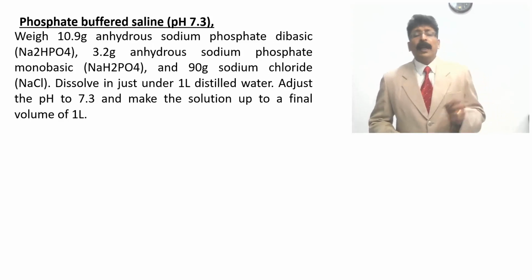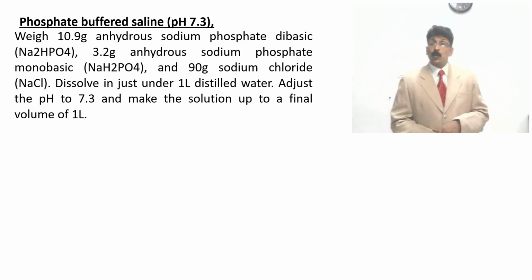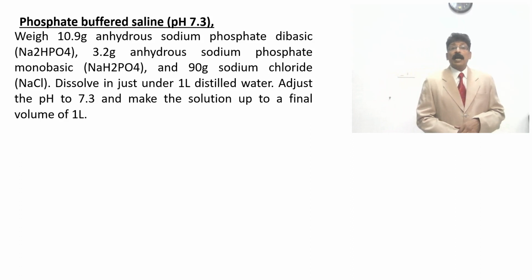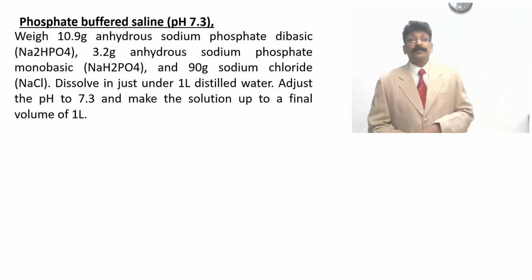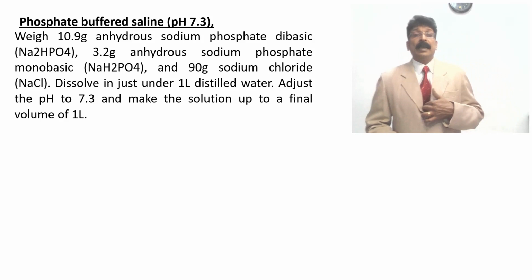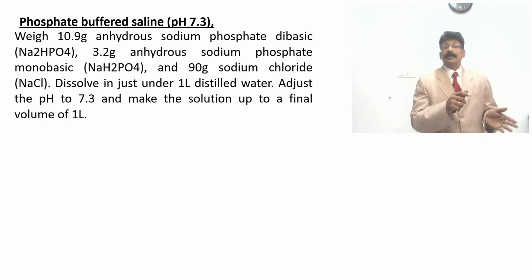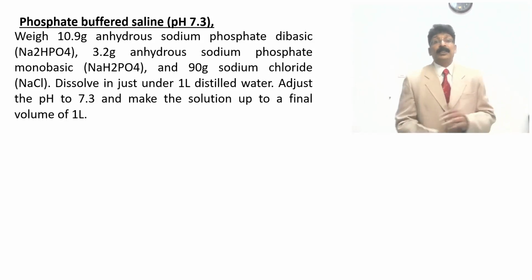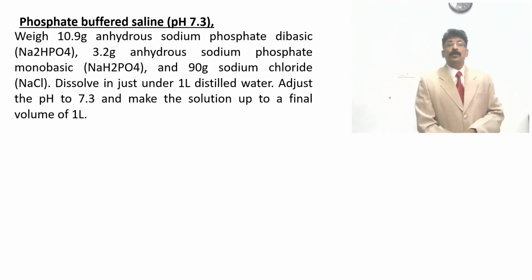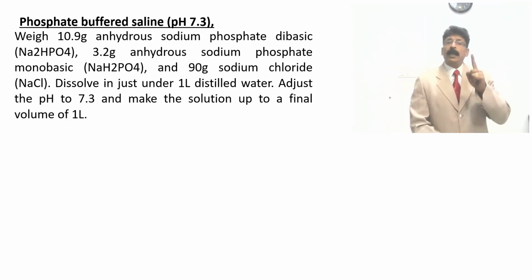Weigh 10.9 grams of anhydrous sodium phosphate dibasic, Na2HPO4, 3.2 grams of anhydrous sodium phosphate monobasic, NaH2PO4, and 90 grams of sodium chloride, and dissolve in 1 liter of distilled water.